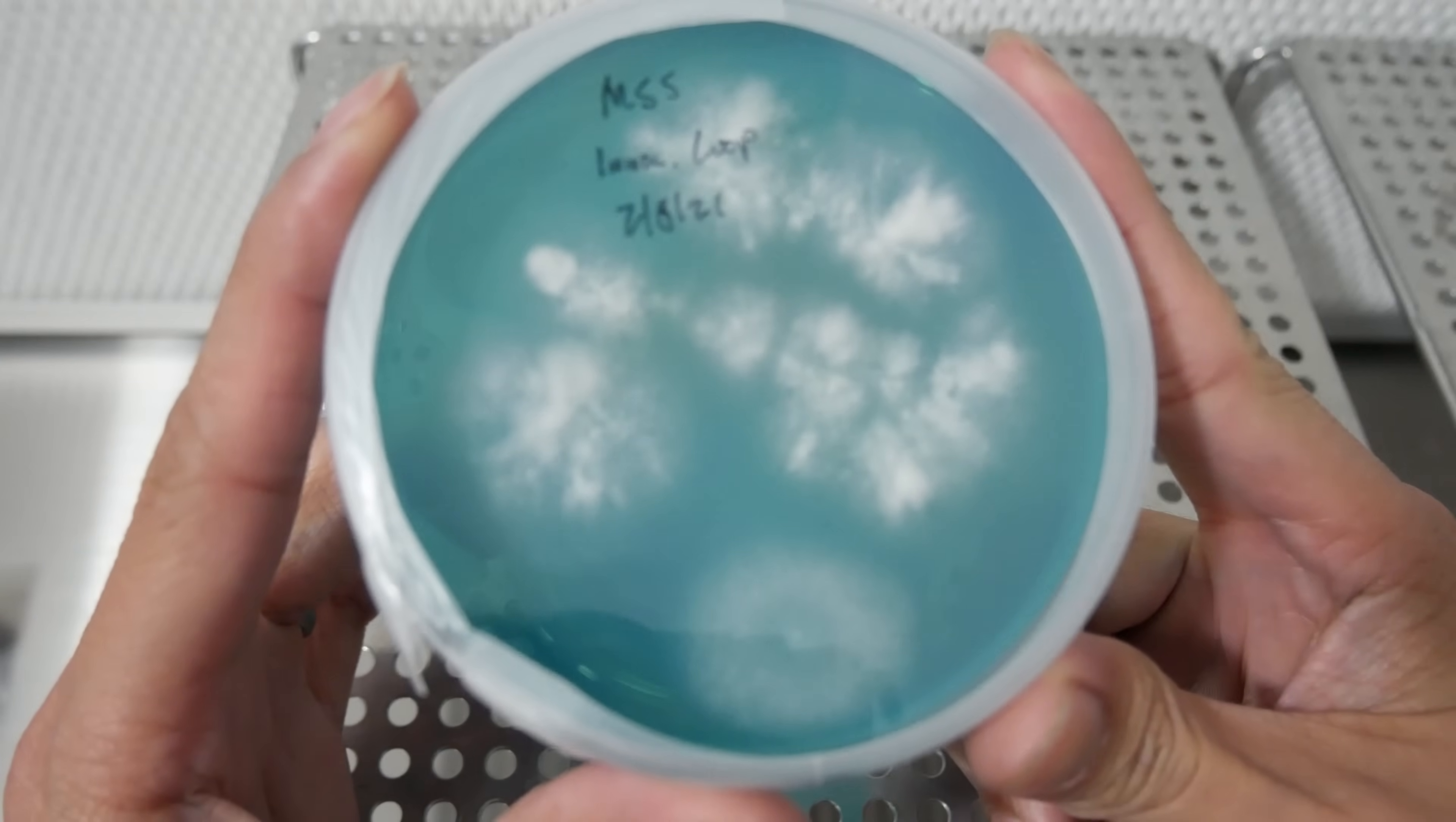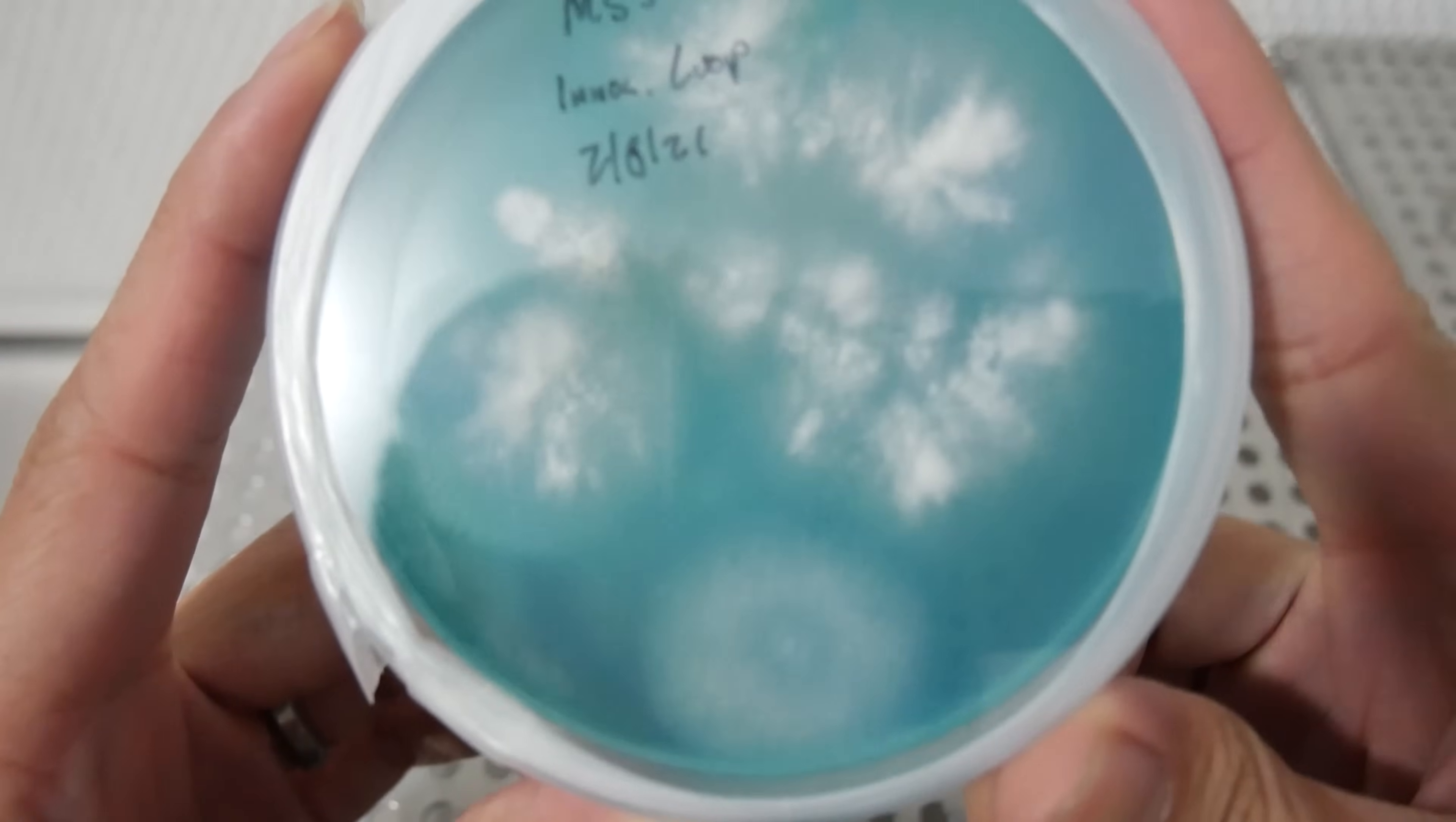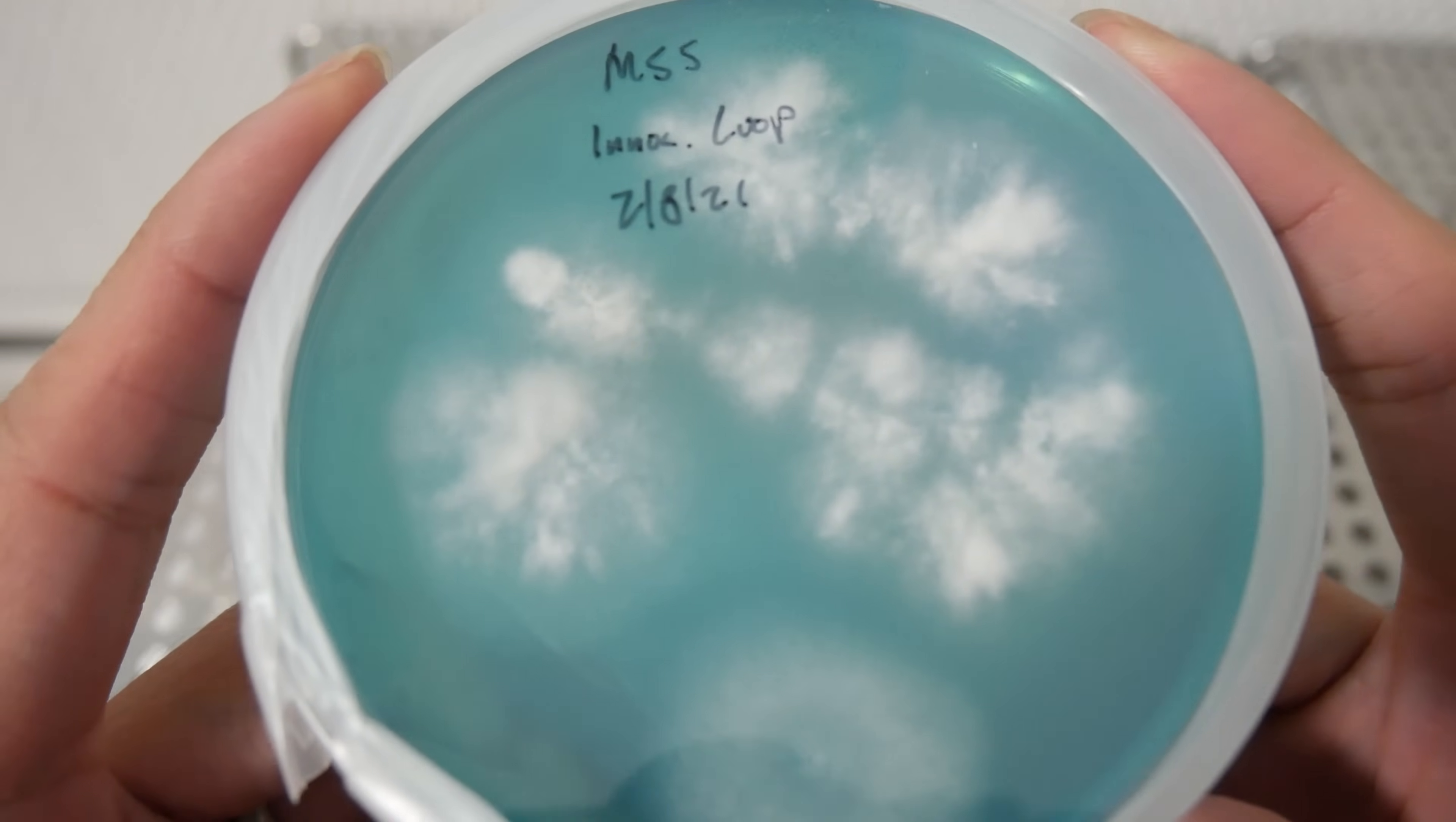Here's our inoculation loop plate. I'm gonna make transfers on this dish. There seems to be a little bit of some mold growing at the bottom there, so I'm gonna transfer my clean mycelium that's furthest away from that point.